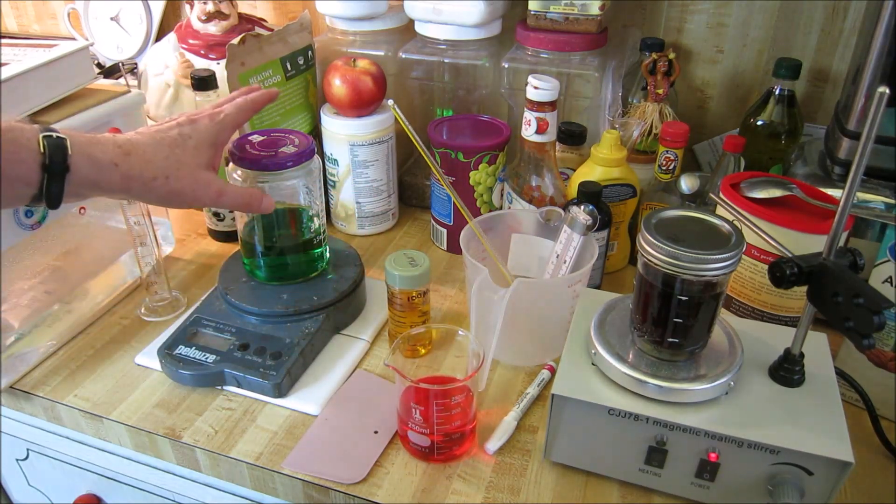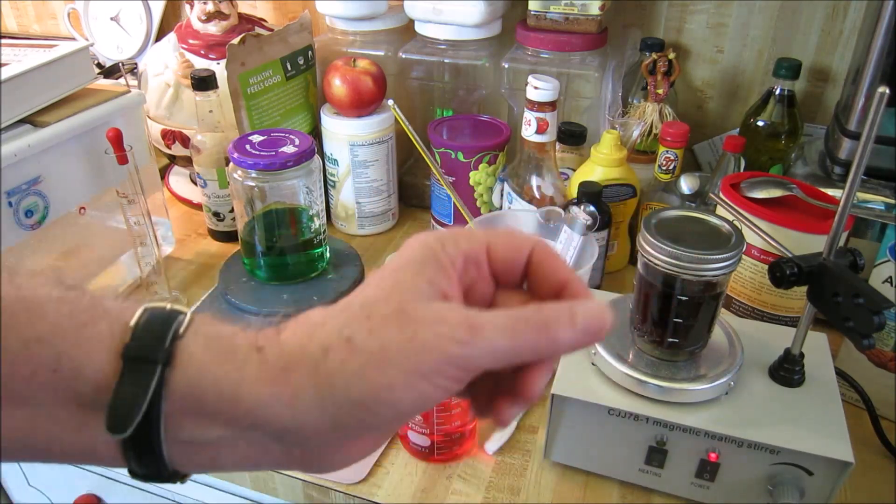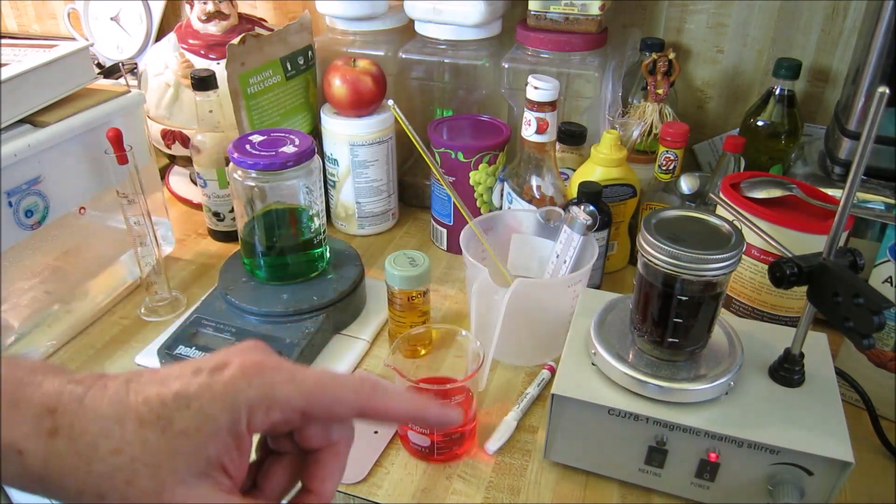So that's how we make our own lab work. You can make it with flasks, you can make your own cylinders if you find something really narrow.